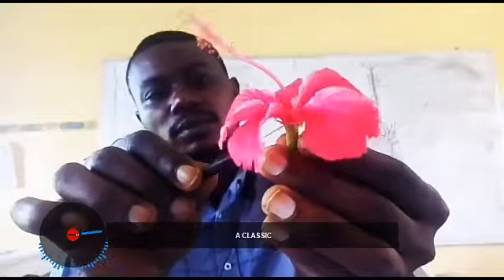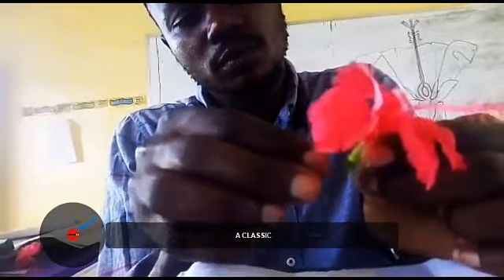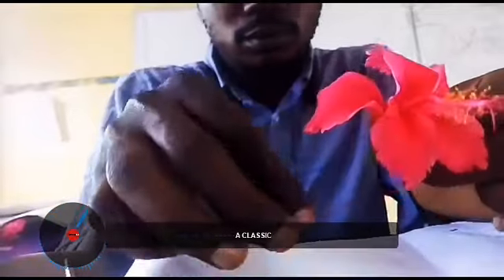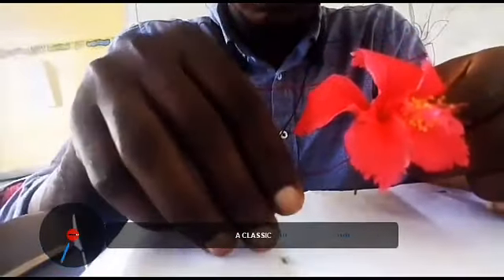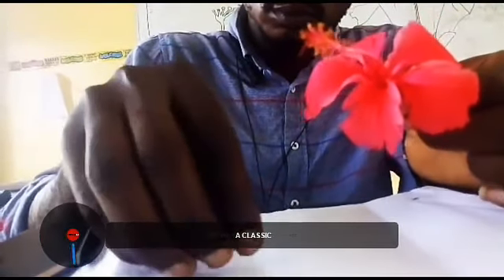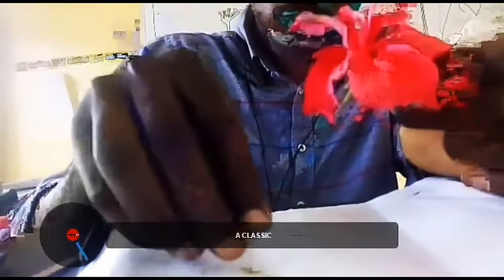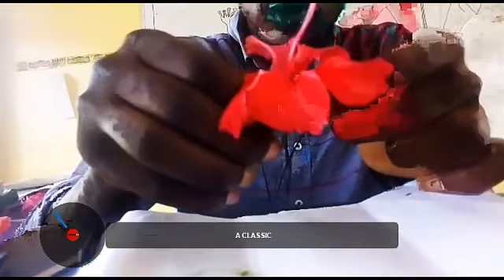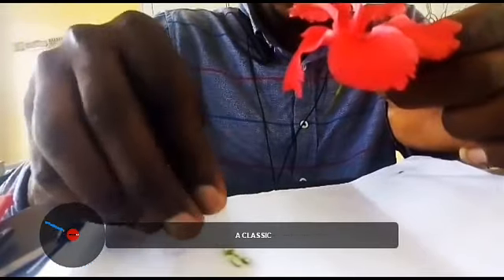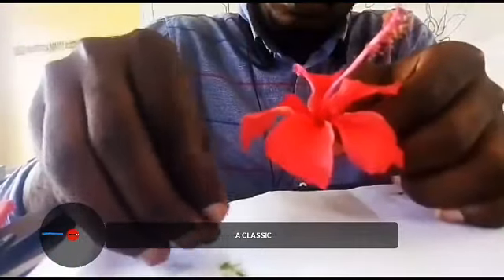So we look at the sepals, we do the dissection of the sepals and the epicalyx. Now we are actually going to remove the epicalyx, the first one, the second one, the third epicalyx, going to the fourth one, the fifth epicalyx, and moving straight to the last one, we have the sixth epicalyx.